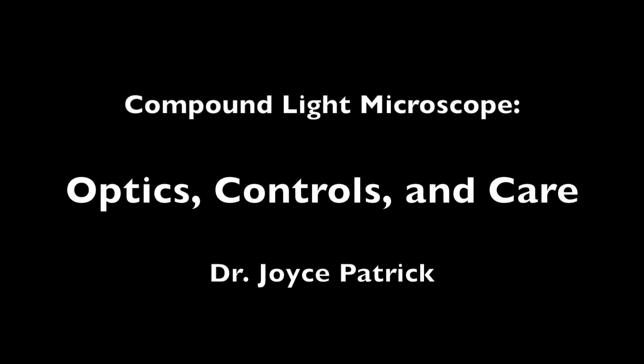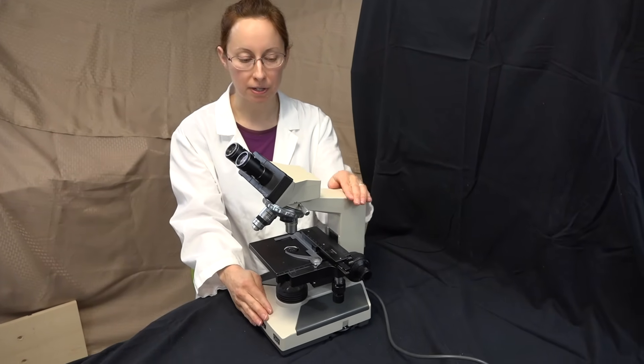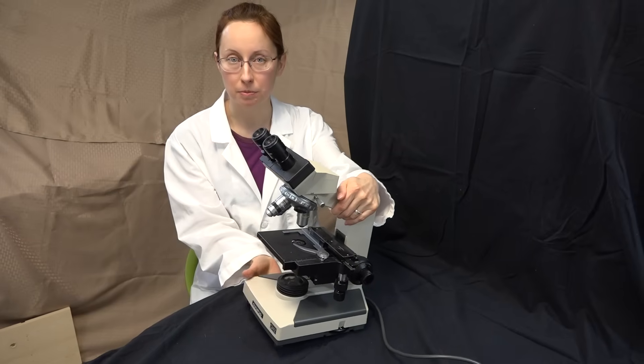In this video, I'm going to demonstrate the parts and operation of the Compound Light Microscope. This is the arm and the base. Whenever you pick up the microscope, make sure you hold the arm and support the base.